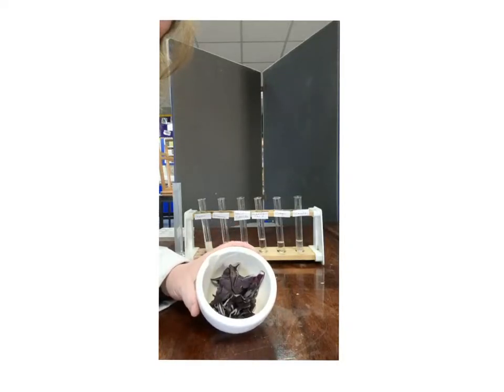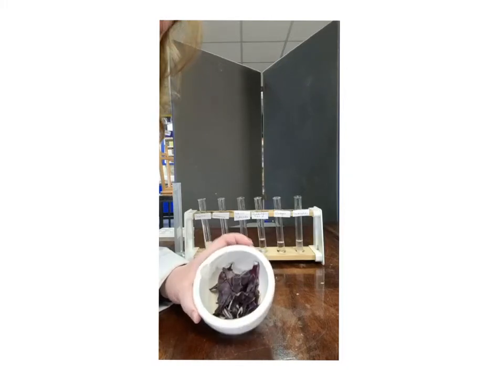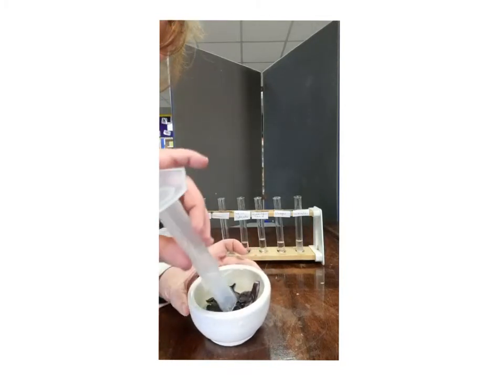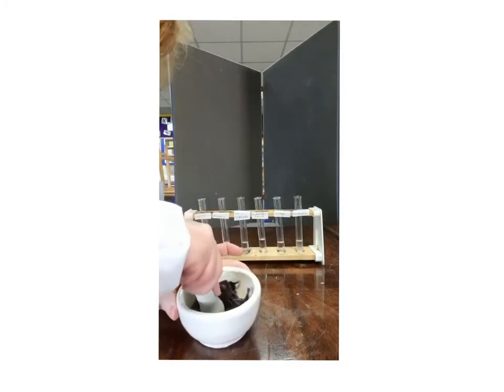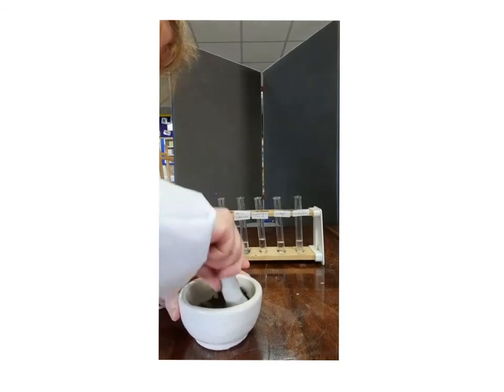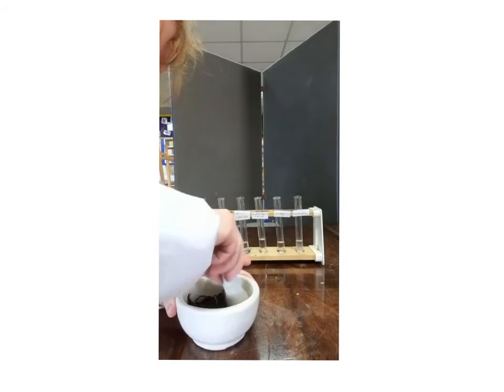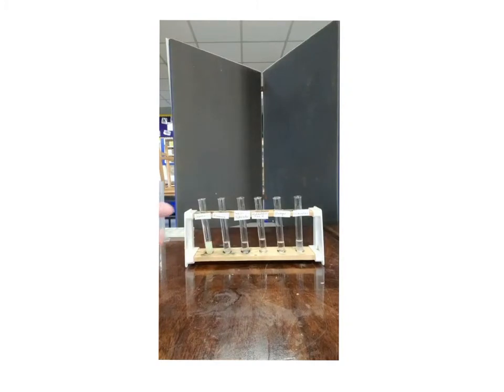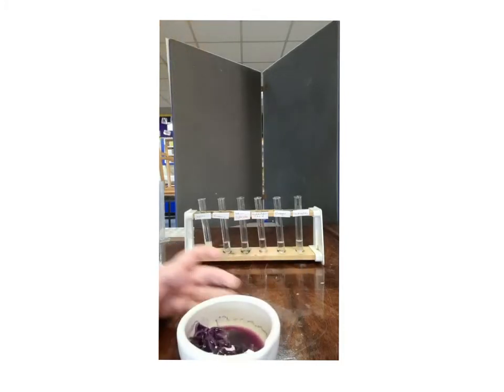Year 8, ask Natalie how to make your own indicator. In this mortar I have some red cabbage, and to it I'm going to add 50 mils of methylated spirits. And with a pestle I'm going to crush the cabbage so I can get all the red dye out of the cabbage. And as they say in Blue Peter, I have done some earlier.